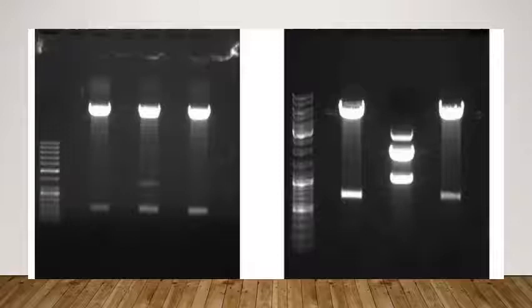According to its size, the different bands we observe and mark, and can find out the group or the specified molecule in the sample. So this is how the gel visualization takes place.